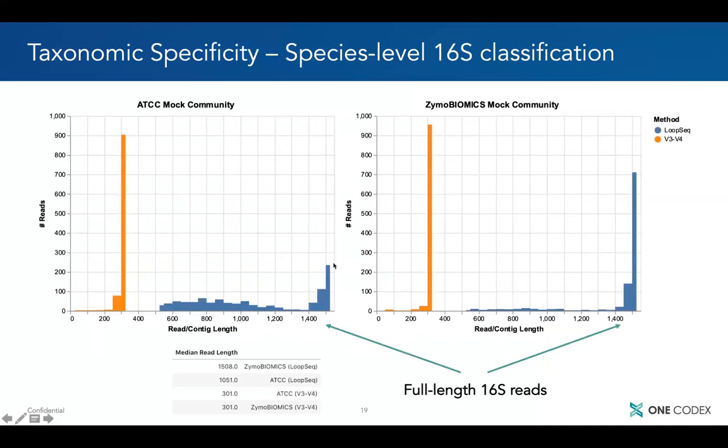And that's what you'd expect because that's the full length of the 16S gene in the average case. And then we've got a number of synthetic long reads at lower read lengths, and those are cases where there wasn't enough coverage over the molecule to assemble a complete picture of it, and so maybe it's broken into two pieces, or maybe there's just coverage over one part of it.